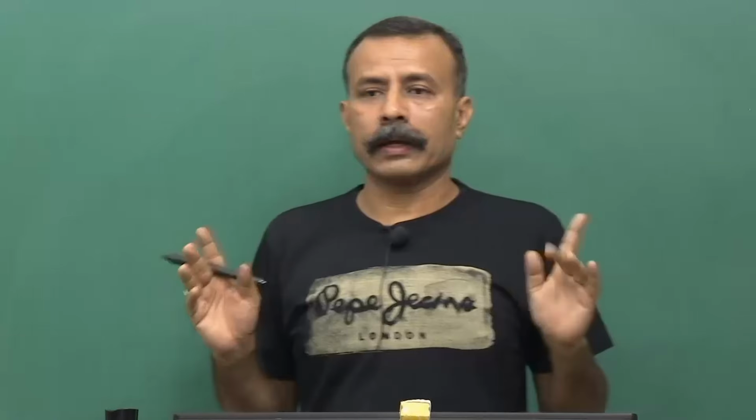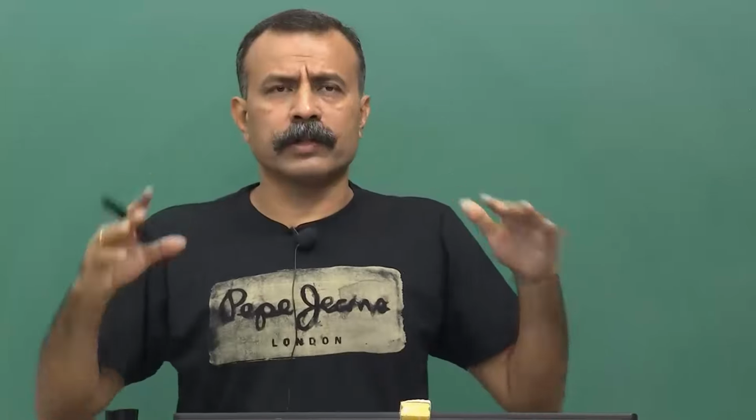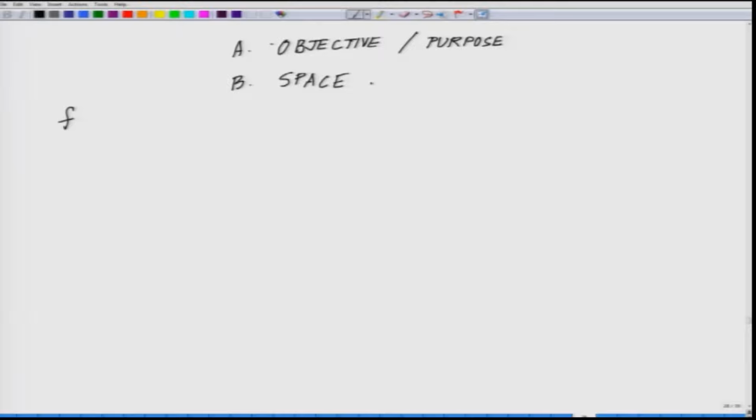So, all over the world, this is very critical because getting a designated space with the vacuum systems and all those things is not easy, because you need certain special things if you want to make it more and more sophisticated. So, space is a big constraint, and the next constraint, related to it, is space management, and that is where the whole design layout comes very handy.